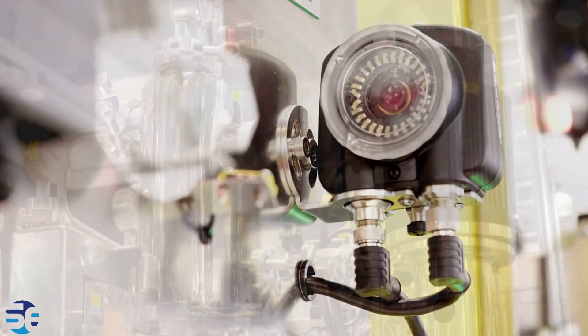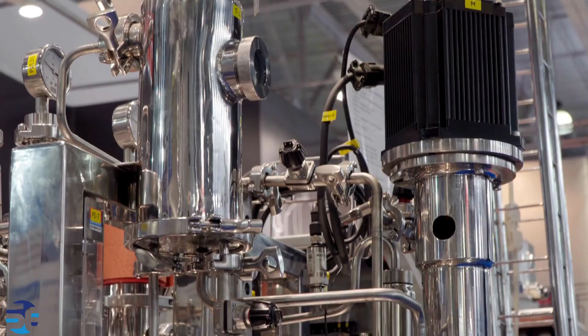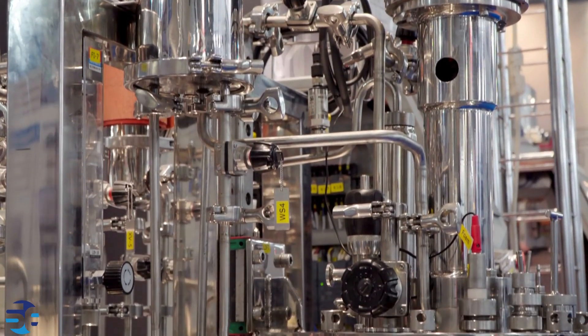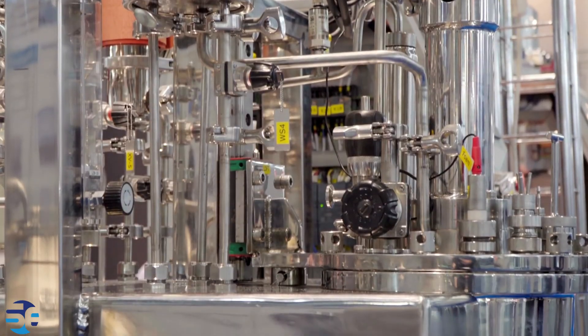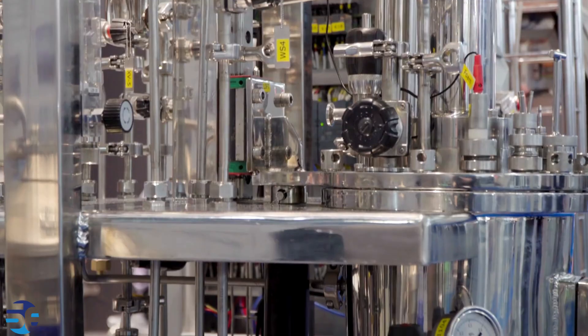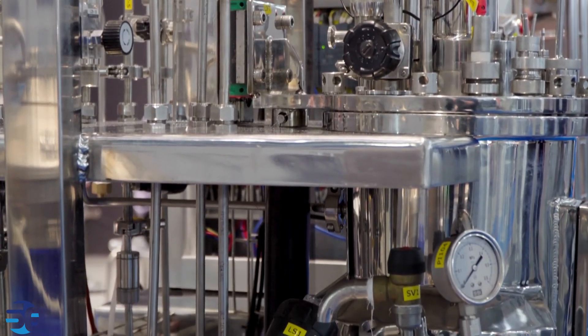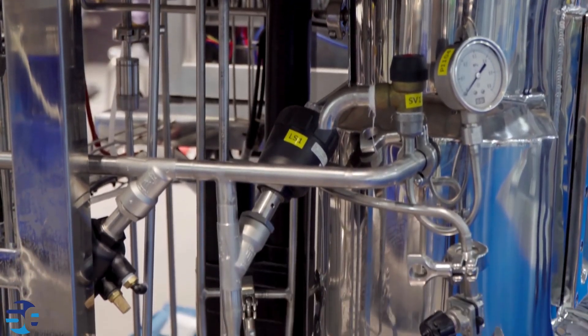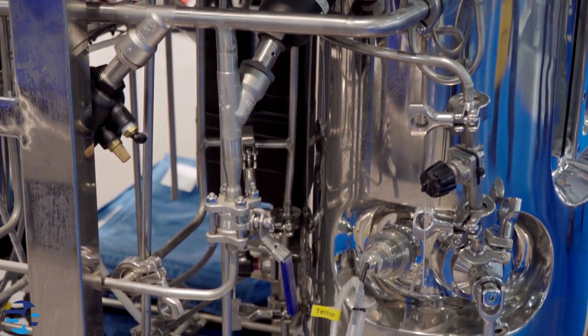Modern autoclave reactors are often equipped with sensors and control systems to monitor and adjust parameters like pressure, temperature, and stirring speed. High-pressure autoclave reactor systems help to maintain the desired reaction conditions and ensure the safety of the process.